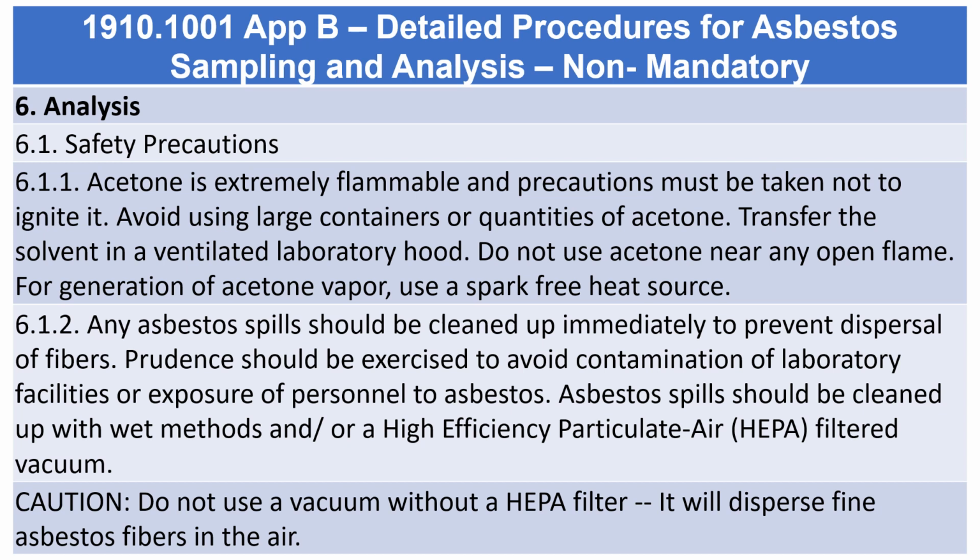6.1. Safety precautions. 6.1.1. Acetone is extremely flammable and precautions must be taken not to ignite it. Avoid using large containers or quantities of acetone. Transfer the solvent in a ventilated laboratory hood. Do not use acetone near any open flame. For generation of acetone vapor, use a spark-free heat source.